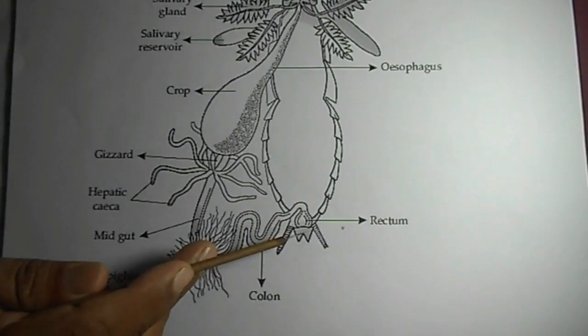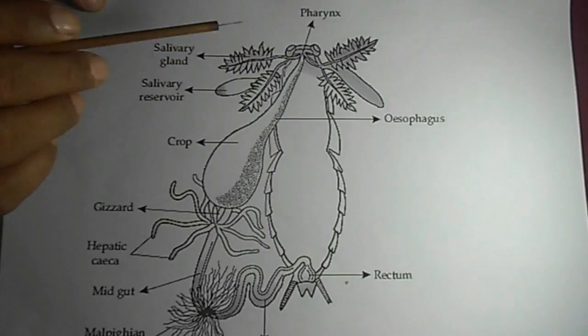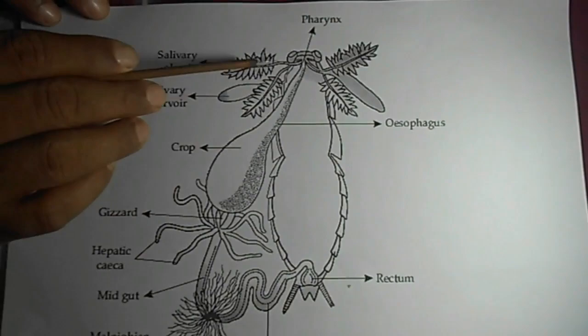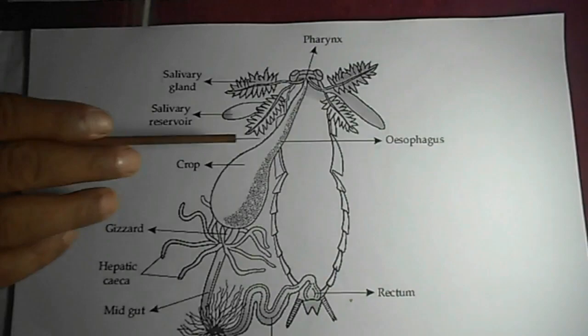The hindgut consists of the colon, rectum, and the anal aperture situated in the 10th abdominal segment. I would also like to mention that two salivary glands are present. These are leaf-like salivary glands, and there are two salivary reservoirs. The salivary duct opens at the base of the hypopharynx. So this is all about the digestive system of cockroach.